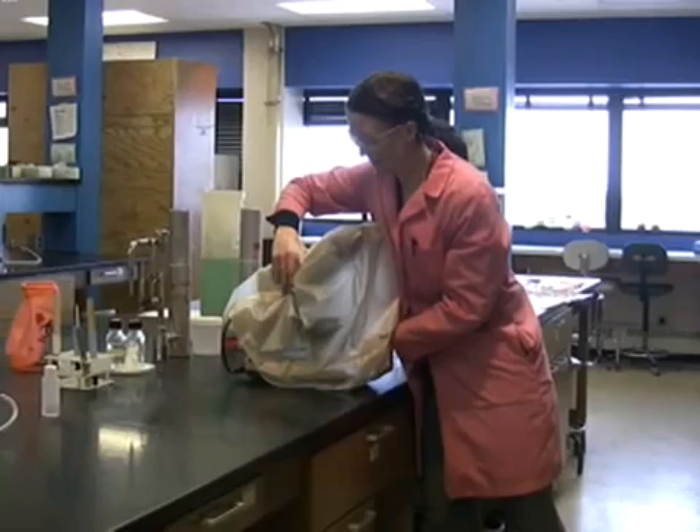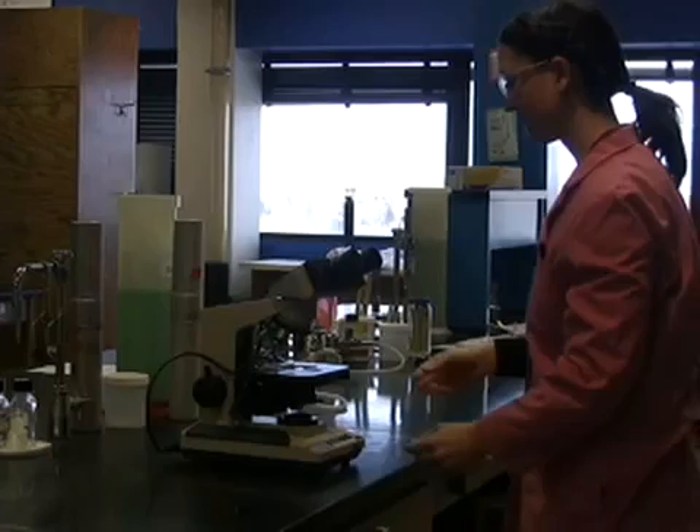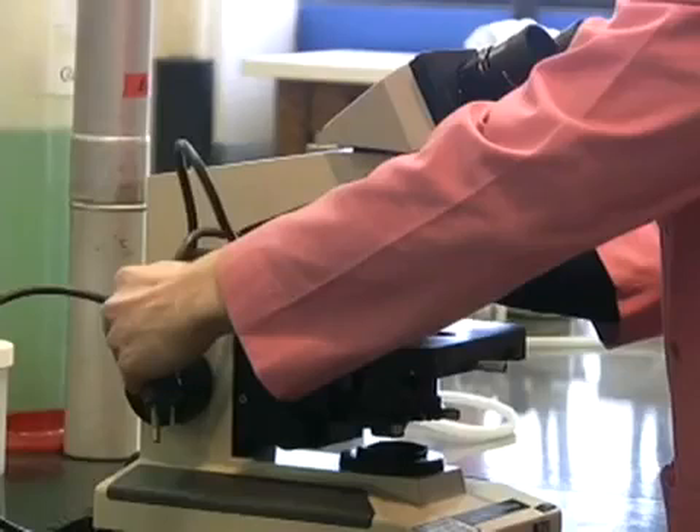Whenever you take your scope out from underneath the bench, make sure to put two hands — one under the base and one on the arm. As you set your microscope onto the benchtop, don't slide it around. There are little rubber footies on it that really jar the lenses if you do so.